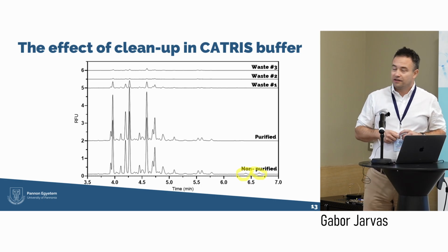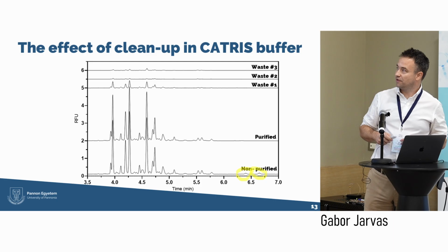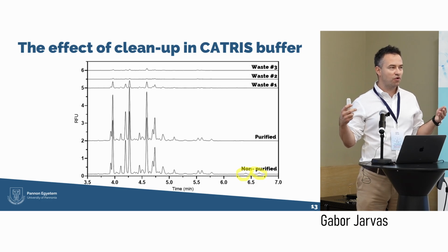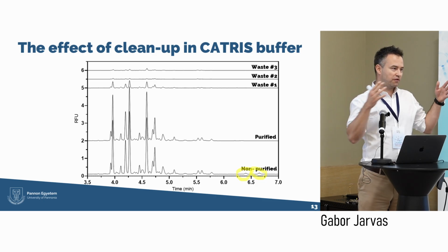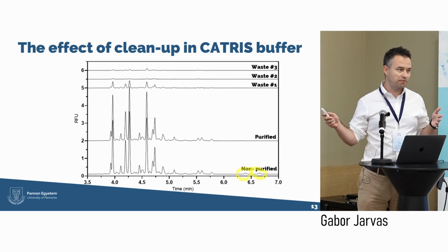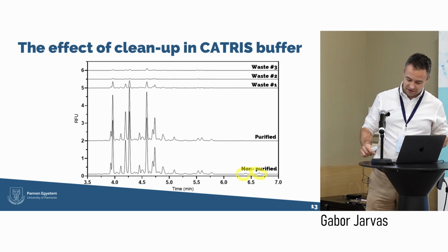And again, I believe it's not just the case for the CE-based glycan structure analysis, but also for the HPLC approach. So if we have this purification-free approach, then we can get a much closer profile to reality. Because what we have measured so far, I believe we always missed those peaks, as demonstrated here, for example. Of course, this is just an example, but we had the feeling that we lost so many glycans in the last couple of years.